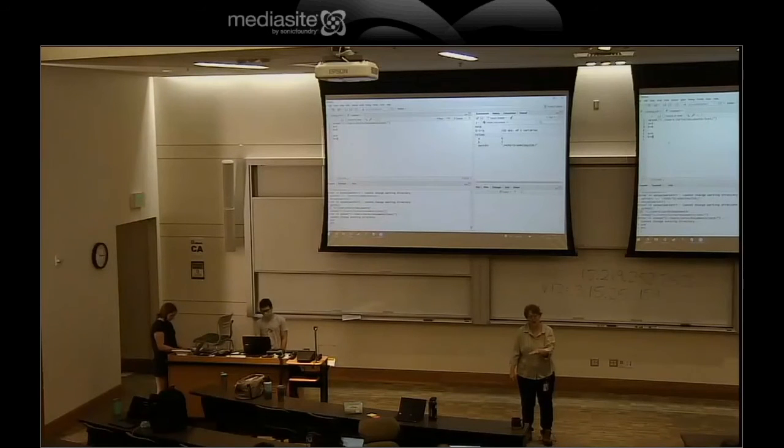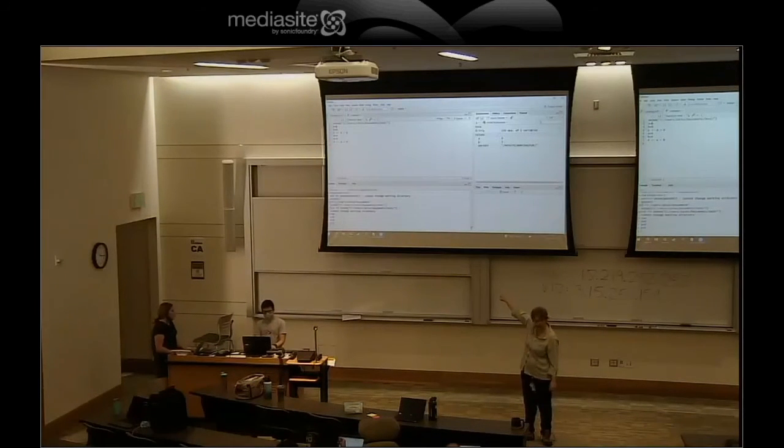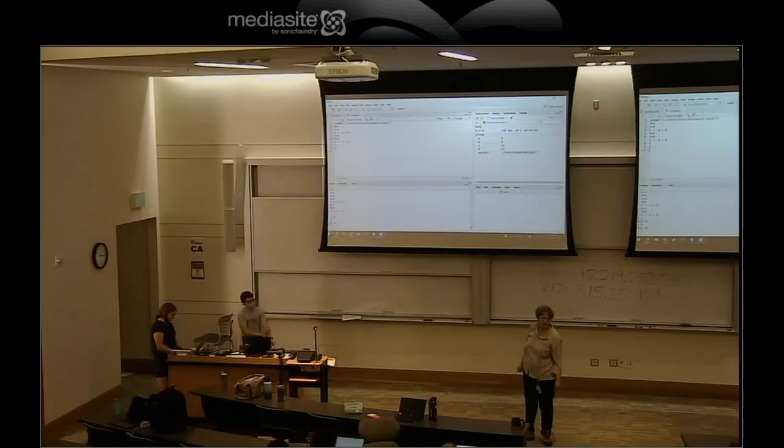Another good reason to use scripts, because I know I was terrible. I once had one script importing another script, and I had set my working directory, and then I would import the second script, and the first script had another working directory in it. And so I couldn't figure out where the heck my stuff was going because it was overwriting it every time, okay? So keep your scripts, write everything you're doing in the top, and only use the bottom if you're doing something like head or tail. Otherwise, it should be written in the top, and you should hit the run button, okay?